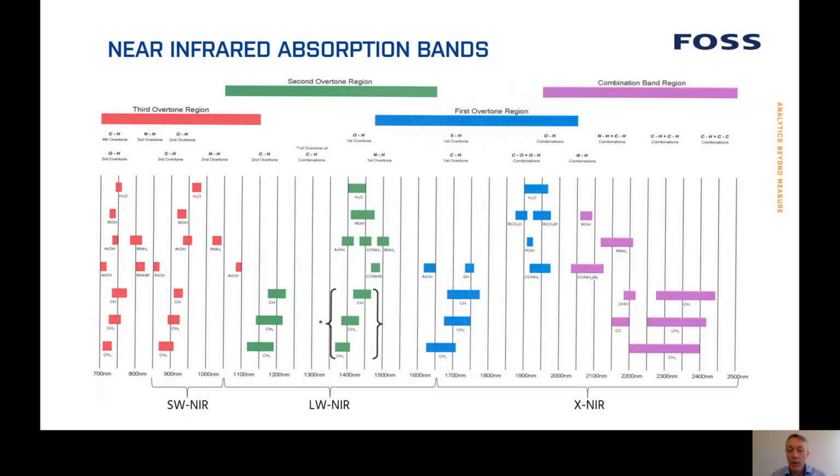This depends both on the parameters you want to measure, the heterogeneity of the sample, how the sample can be accessed, and other factors that may be specific to your application. I will get back to this in the third and last part of this webinar.